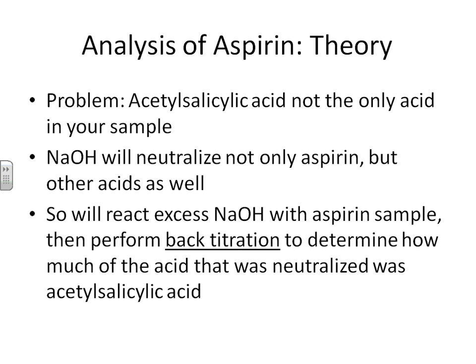So what we're going to be doing for the analysis of aspirin is that we are going to react sodium hydroxide, which is a base, with our sample, which contains multiple acids. The sodium hydroxide will neutralize all of the acids. We are then going to add excess sodium hydroxide. The reason we're adding the excess sodium hydroxide is because the excess hydroxide will only react with the aspirin sample. It will only react with the product of the original aspirin neutralization.